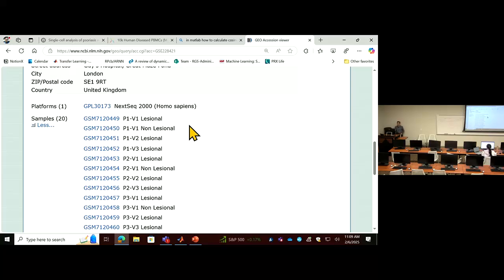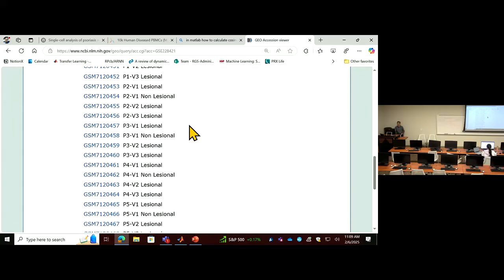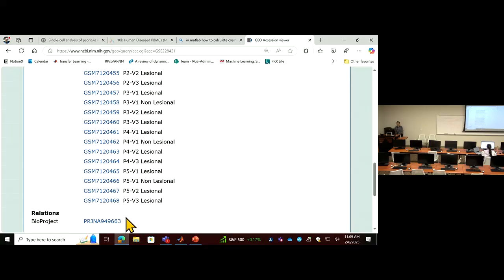In this study, they have different numbers of patients, 5 of them. So we have P5, P5, P5, P5.